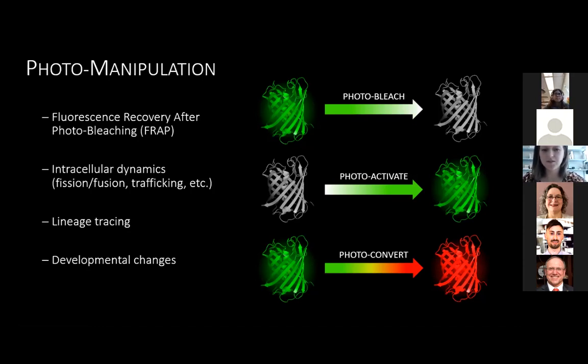One of the other things you can use it for is for structural changes in your sample. My previous supervisor, Luke McCaffrey, did an experiment with this where he was looking at mammary gland duct elongation. And he wanted to know if the ductal elongation was happening at the end, at the terminal end bud, or if it was happening within the body of the duct itself. So he actually just photoconverted strips along the duct and then imaged them later. And he actually found that the duct was elongating in the body of the duct and not at the terminal end bud. So he was using them as a marker for structural changes, which is very interesting.